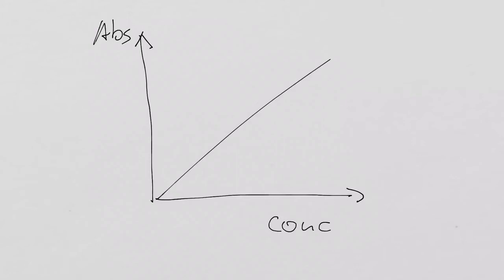From this standard curve, we then can say, right, we have a curve, well, looks a little bit like a curve, but the intention was a straight line, actually. Never mind, it's too early.